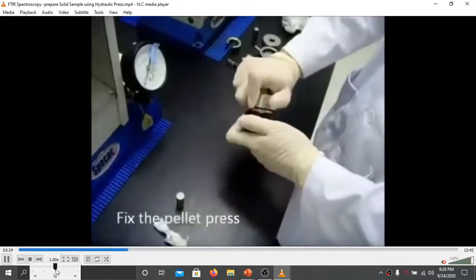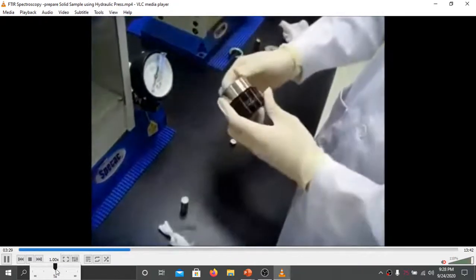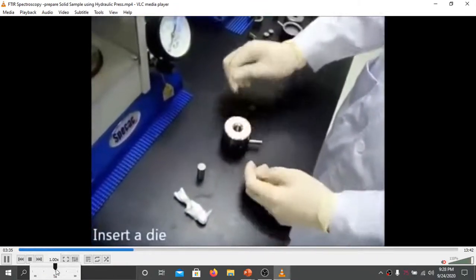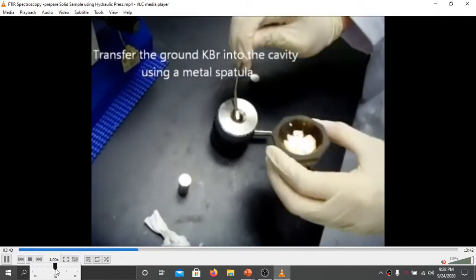Then the upper part of your die is fixed with the bottom part. One die is inserted. The KBr is slowly added into this using a small spatula.